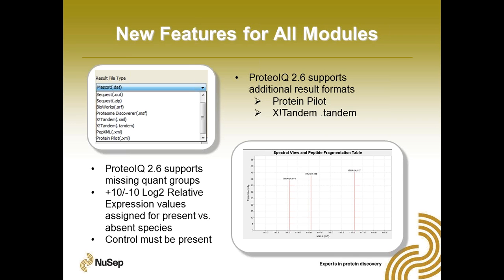So let's kind of go through these new features one by one. Let's start with new features that are applicable to all modules. As I would mention, we're not going to spend much time on this today, but if you are a Protein Pilot user and you want more detailed information on how to do this conversion, just let me know. We'll send you the link to the documentation.